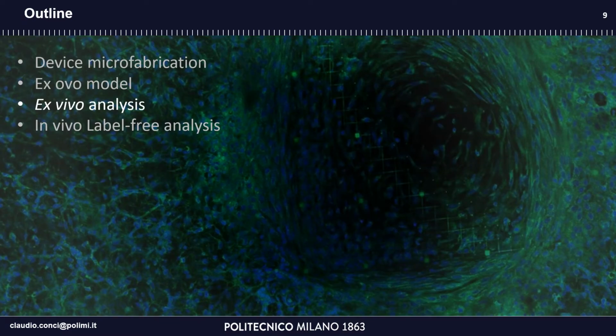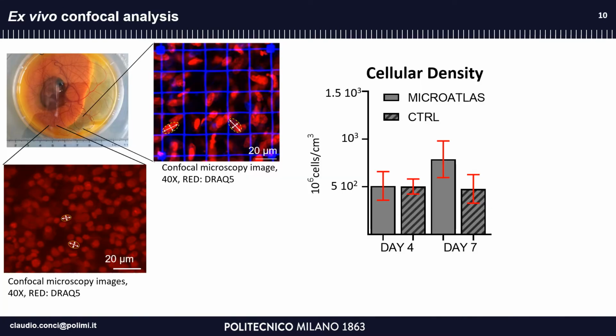Then we demonstrate the cell repopulation inside our device by exploiting an ex vivo confocal fluorescence analysis. By exploiting confocal fluorescence microscopy, we demonstrated the feasibility of the Microatlas in quantifying the cellular density inside our microscaffold with respect to a control tissue.